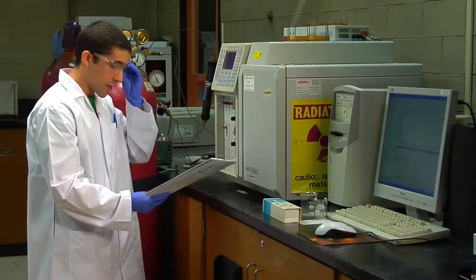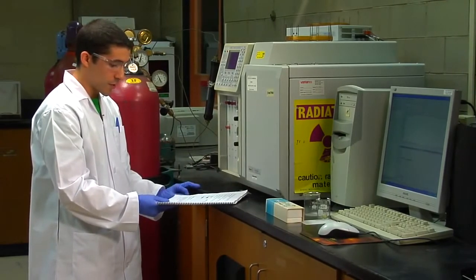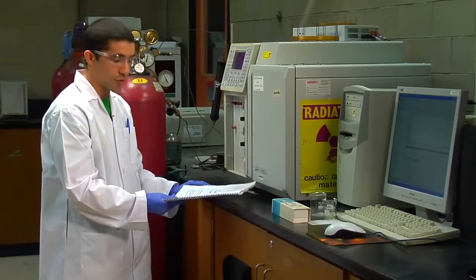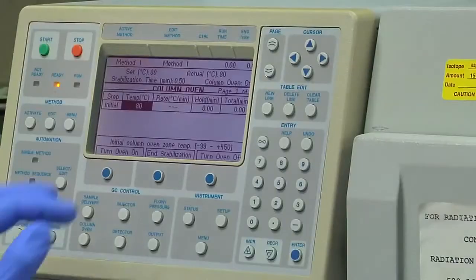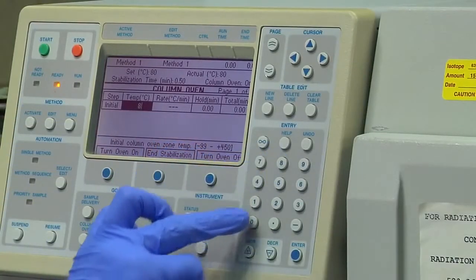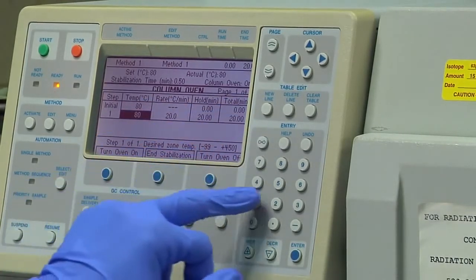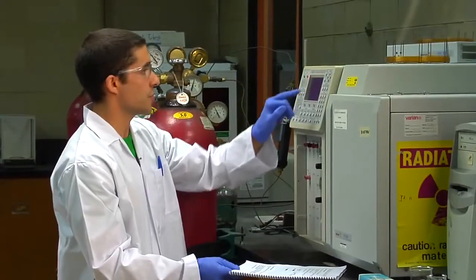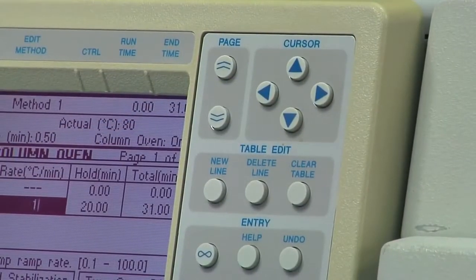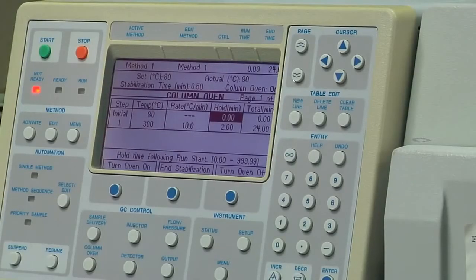So in the manual, it asks to use an initial temperature of 80 degrees Celsius and to increase it to a final temperature of 300 degrees Celsius at a rate of 10 degrees per minute. So I'll set it to 80 as my initial temperature, create a new line, and use my final temperature of 300 degrees, change the rate to 10 degrees per minute, and there, now it's set.